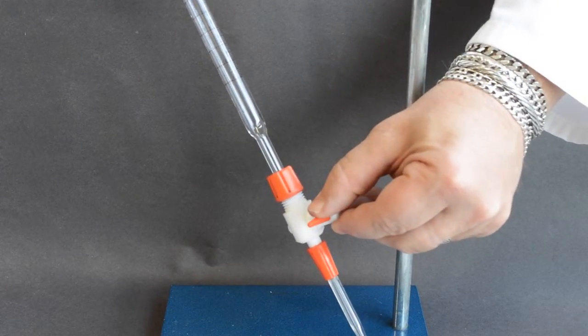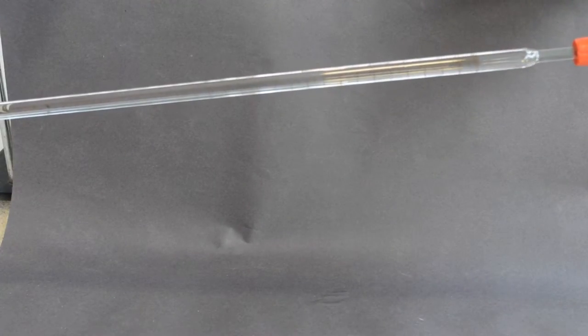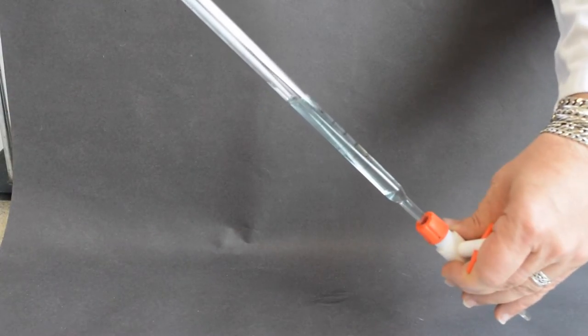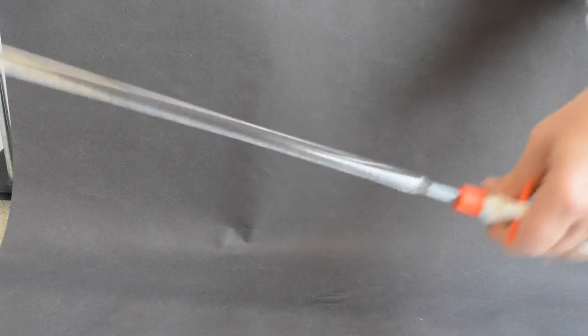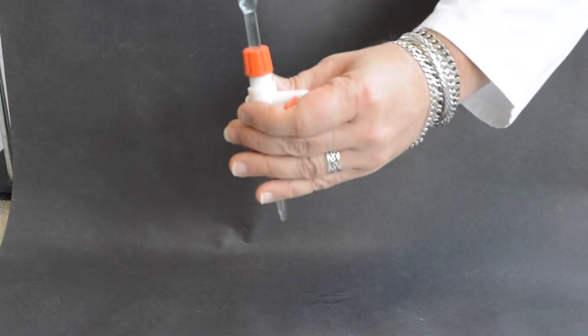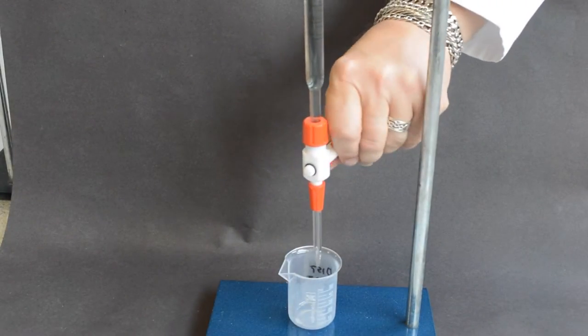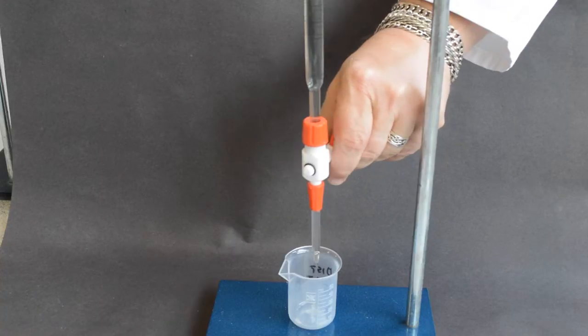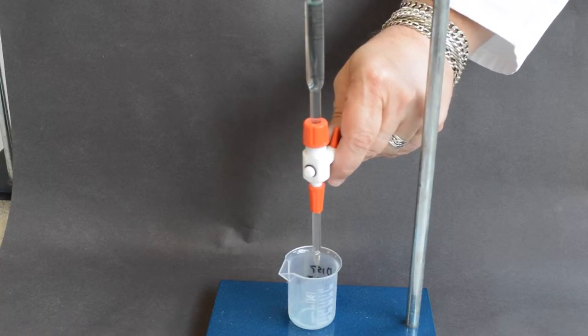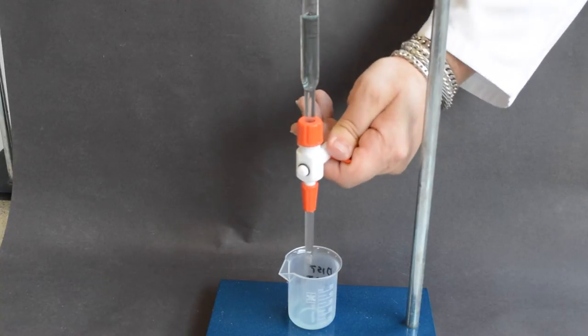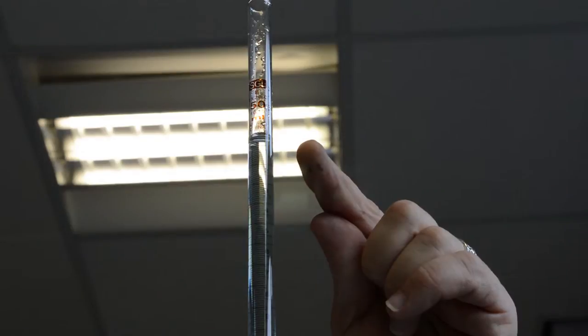Ensure that the burette tap is closed before adding copper sulfate. The burette must be conditioned by using copper sulfate from your sample to rinse through the burette. Open the burette tap and release some of the copper sulfate into a beaker to ensure that there are no air bubbles in the burette tap. Note the initial reading of the volume of copper sulfate in the burette.